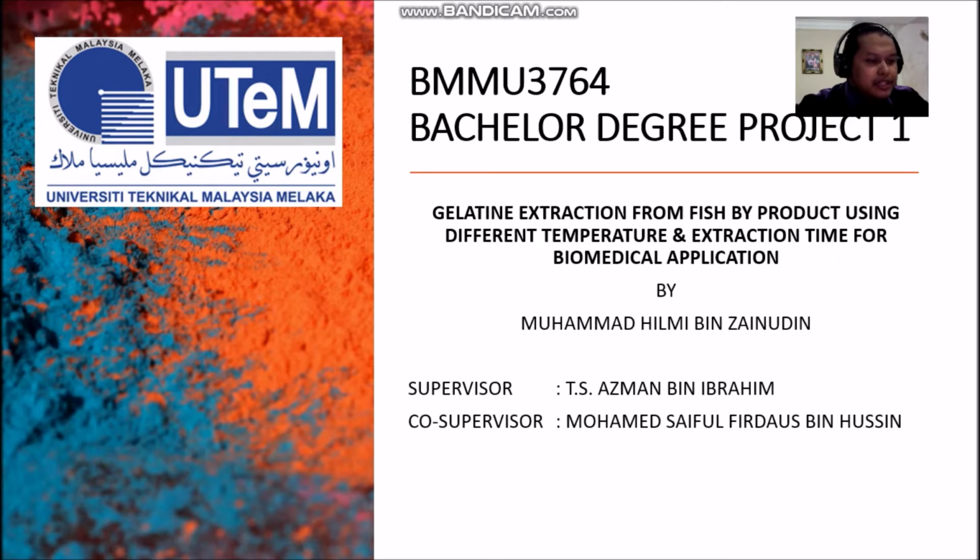Today, I will be presenting about my project proposal for PSM1 titled Gelatin Extraction from Fish Byproduct Using Different Temperature and Extraction Time for Biomedical Application.